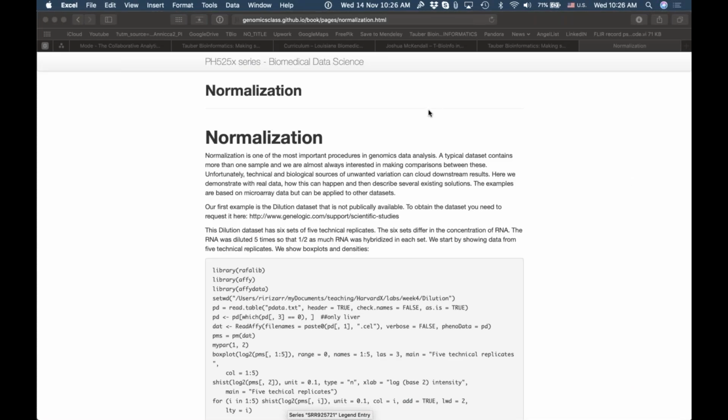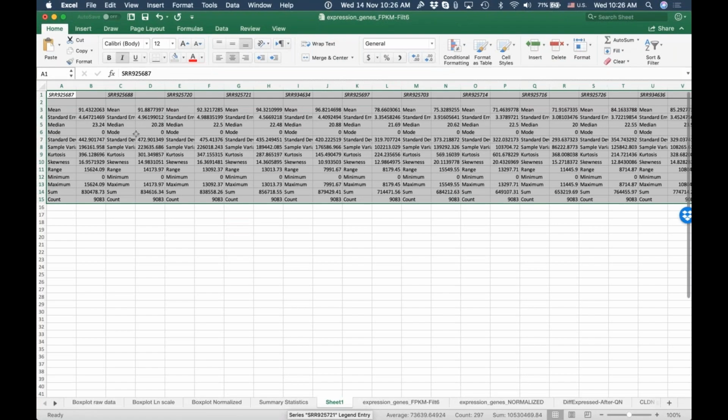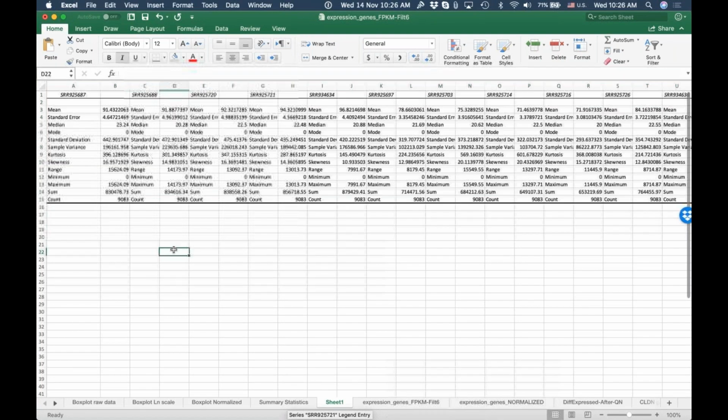it is actually going to generate a new... I went to the other screen, but you see it generated all of this information. Now, this table is a little bit difficult for me to visually look at. So what I would do is I would just select all of these names of columns and paste them here.